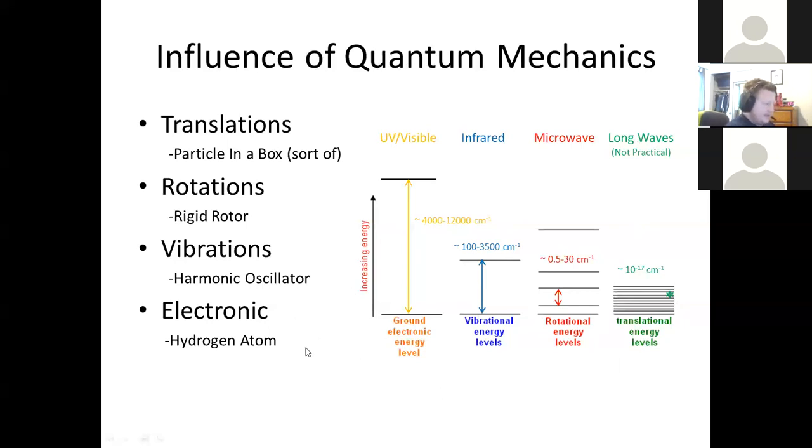There are, like I said, other ways of storing energy. One is what we're going to talk about next week. So I'll be adding to this slide next week when we talk about NMR, where we're talking about the spin flips of a nucleus. Nuclear spin flipping itself is in the megahertz range. It's radio waves that we use to create a spin flip transition, and we'll talk about how we do that next week as well.